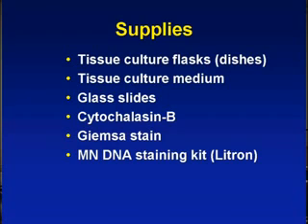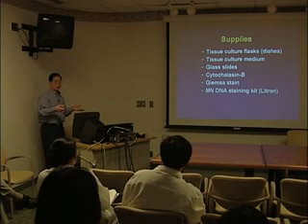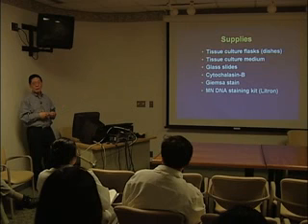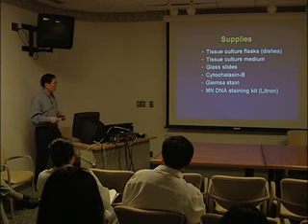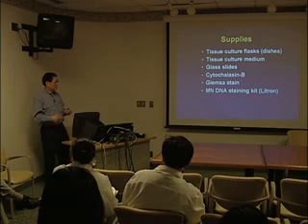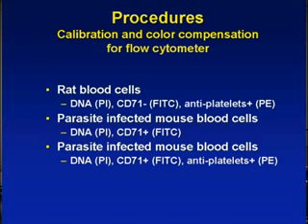Now, this part of the procedure I'm not going to describe anymore because you're going to see it in the basement lab, and Irina Novak is going to give you some demonstration, and also show you the final product of the micronuclei measured from human lymphocytes. So the first few steps, I'm going to show you how you're going to go about the flow cytometry measurement of micronuclei. Now, you purchase the kits.